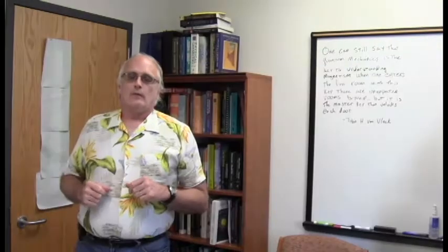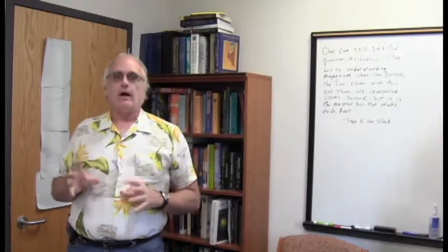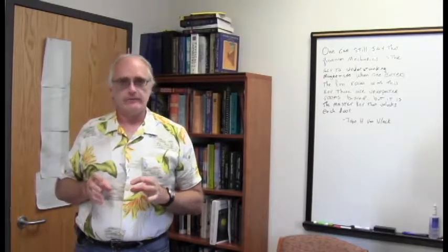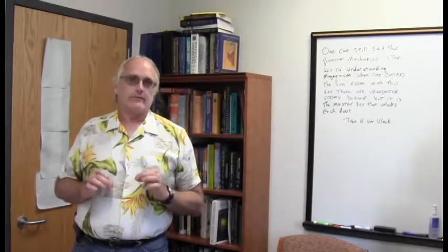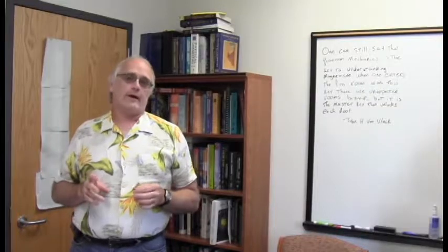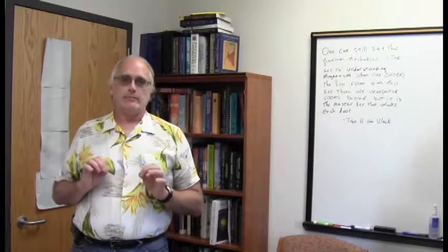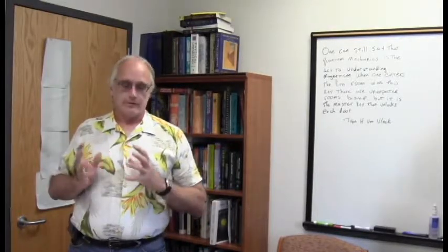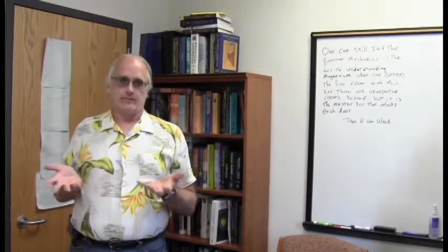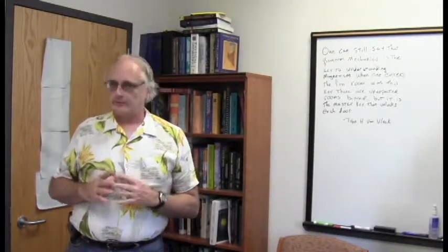So here we go. When you have a big task like this with an awful lot of pieces floating around out there, it's always a good idea to start with the simplest things you have and with some of the basics, the things you know. I'm not going to start this process with the 2D spectra. In fact, I'm going to begin with the carbon and the DEPT results. Because one thing you want to do is just make sure that if you're going to do a full characterization like this, that your proposed structure, and let's face it, the menthol structure is known, and the spectra match up at least superficially.